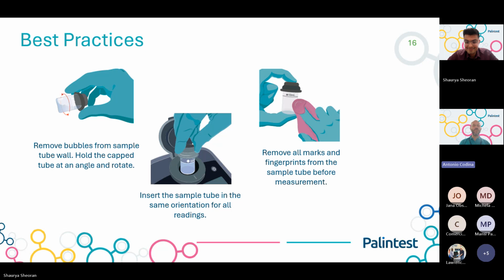But that's why we put a diamond in there, so that you always perform the measurement with the vial in the same position, and that will make your measurement much more accurate.